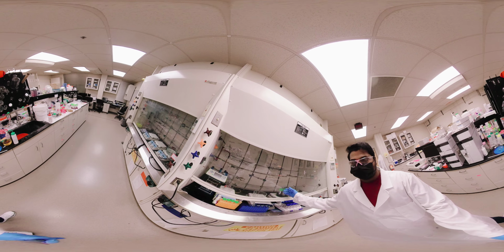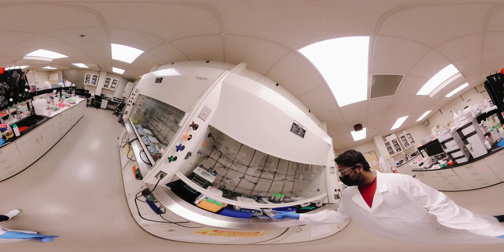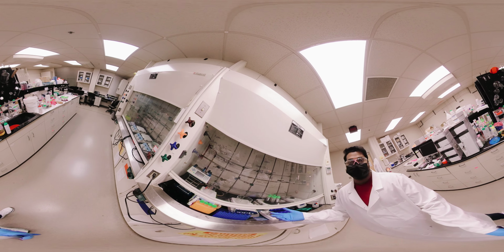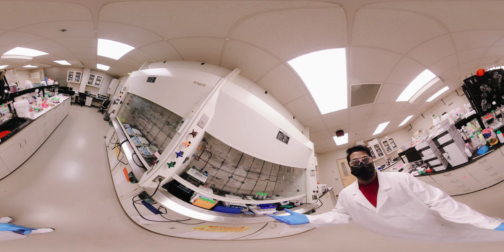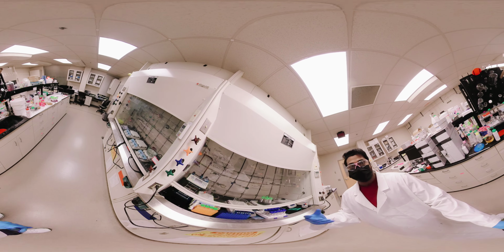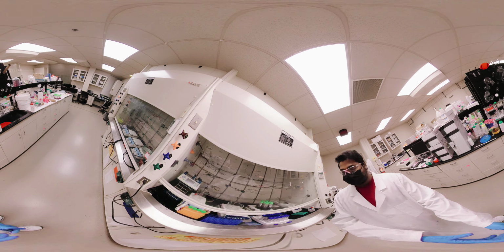We have a glass door, and inside we have several hot plates. We are using these hot plates for our reactions to elevate the temperature, and we can also use magnetic stirring to modify the speed of the solutions, for uniformity.